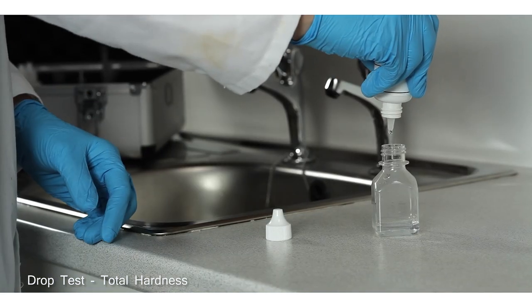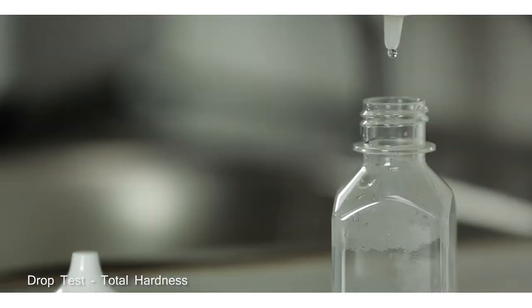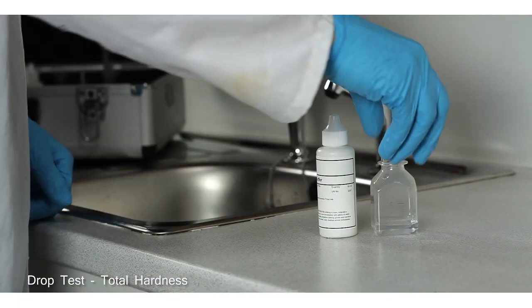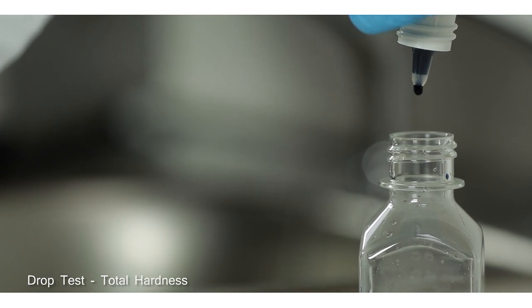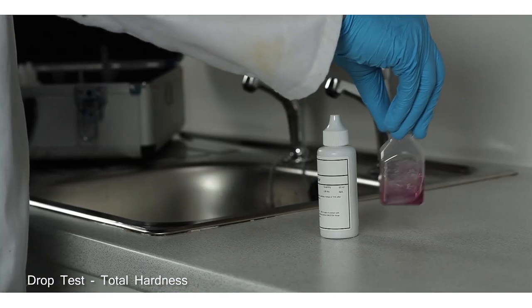Add four drops of TH2 per 20 ml and swirl to mix. Then add four drops of TH5 and swirl to mix.